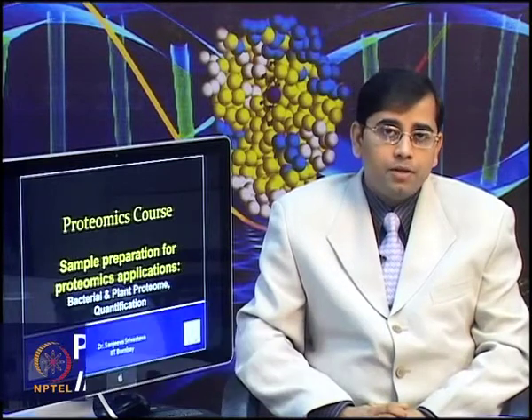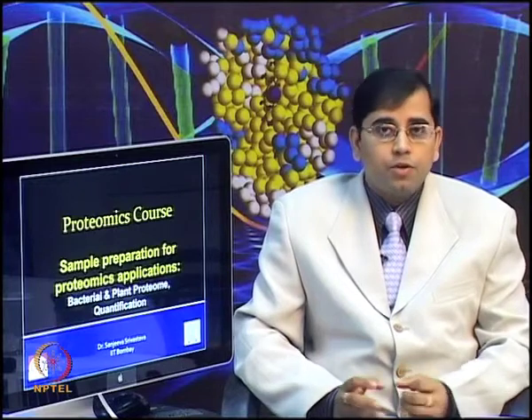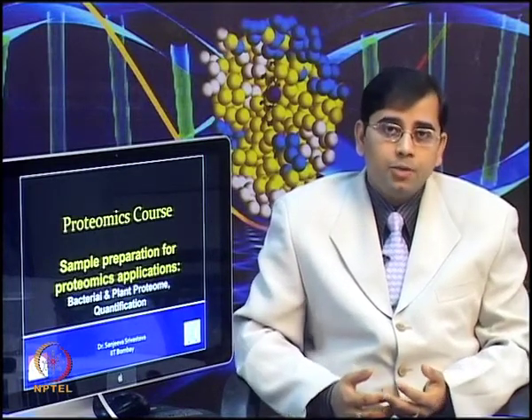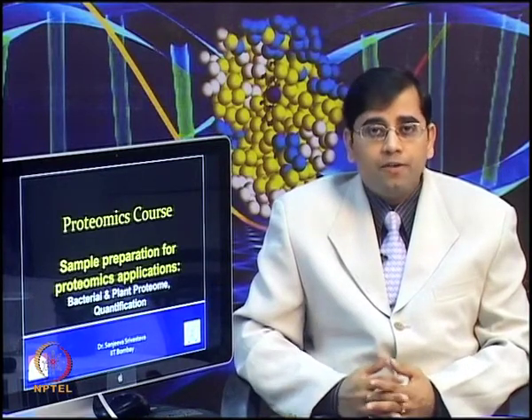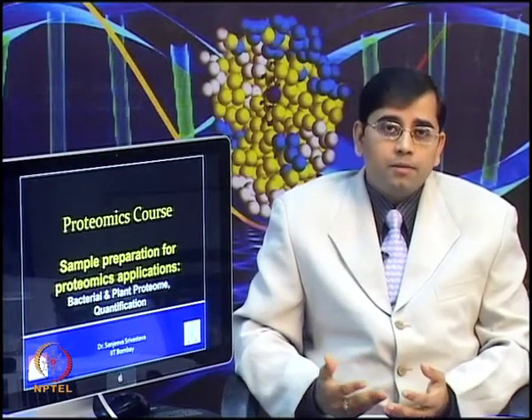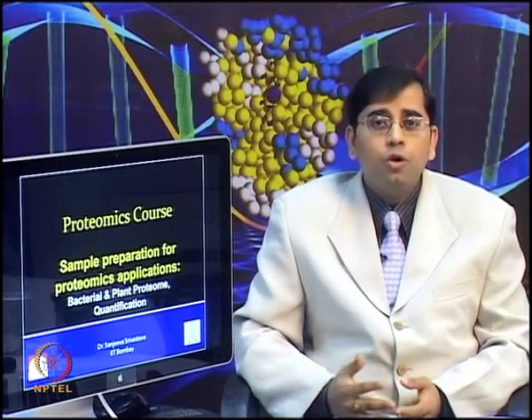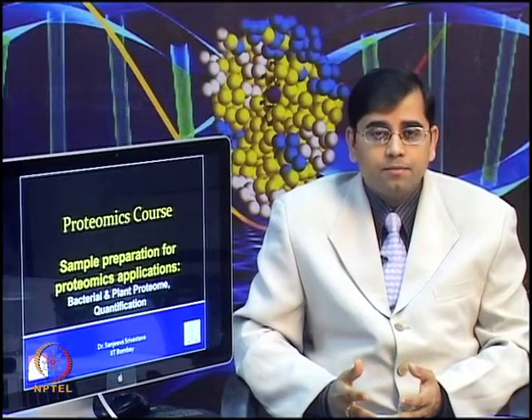We talked about different types of lysis methods. We talked about how to prevent proteolysis during the lysis, and different types of protein pre-fractionation methods. Then we talked about protein precipitation, protein solubilization and how to remove various types of interfering components.